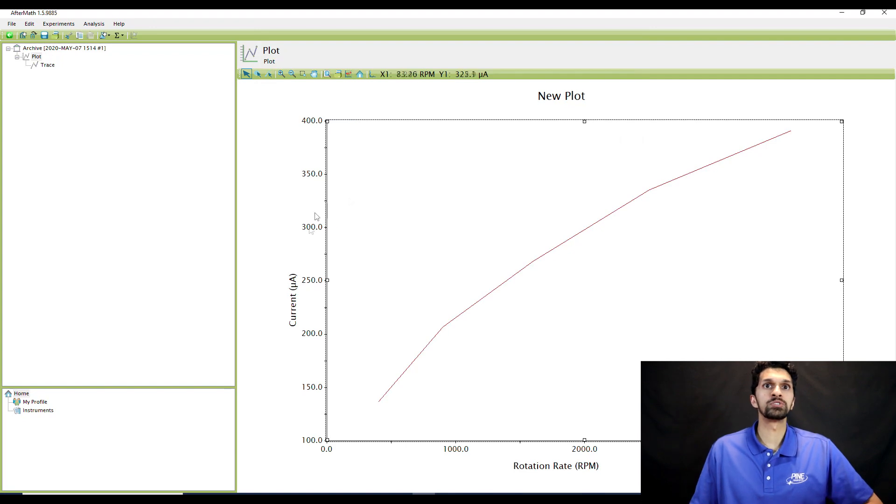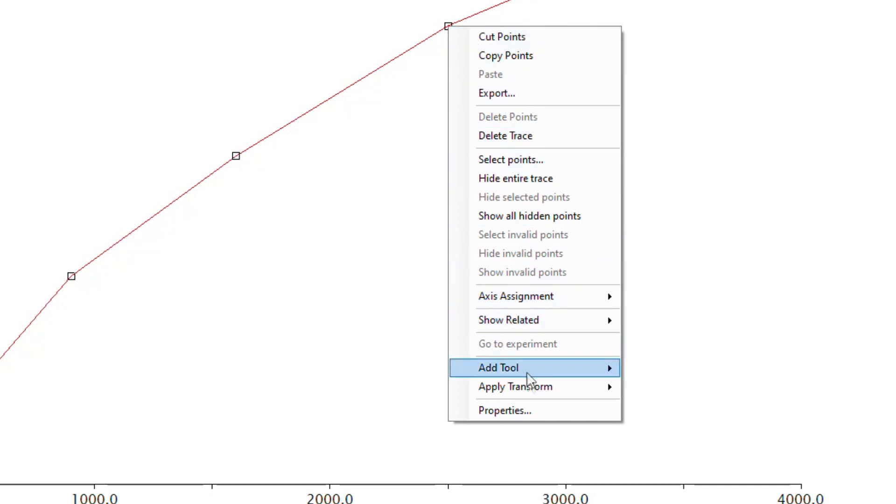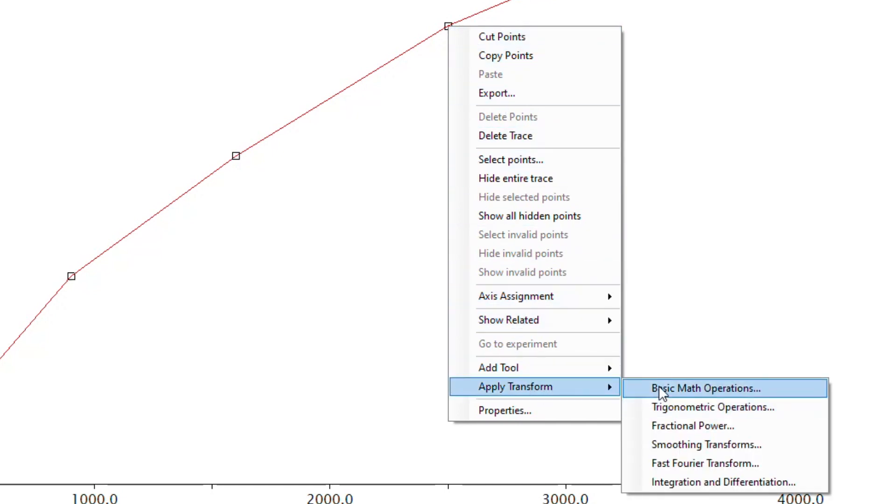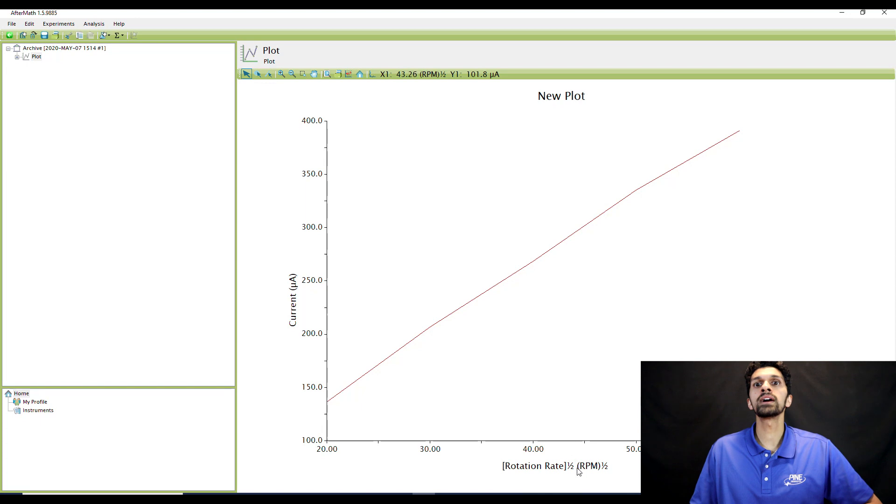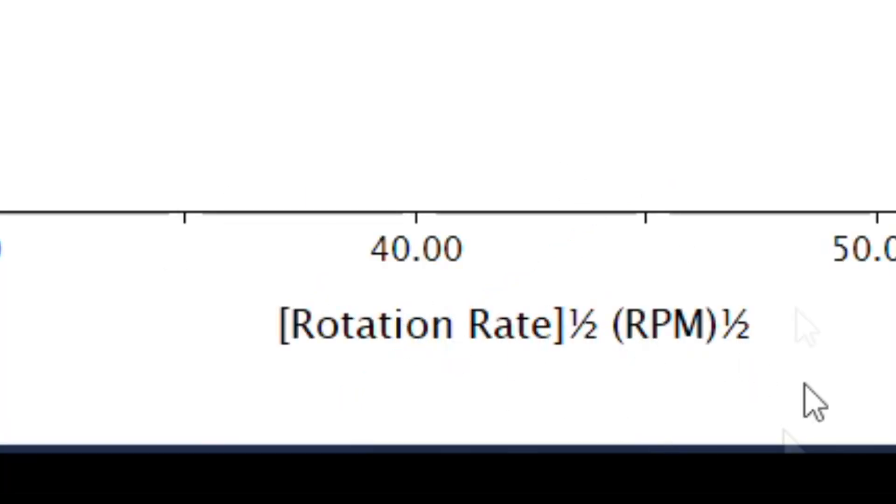All right, and I'm going to hit the x-axis data, because I want to be able to make this plot using the square root of the rotation rate. So I want to raise the x-axis data to the one-half power. So to do that, I can perform a basic math operation. I'm going to left click on the data points, right click, go to apply transform, and go to basic math operation. Then I'm going to perform this on the x-axis data only, and I'm going to hit square root, and then go to OK. And now you can see here in the bottom, I have the rotation rate data raised to the one-half power.